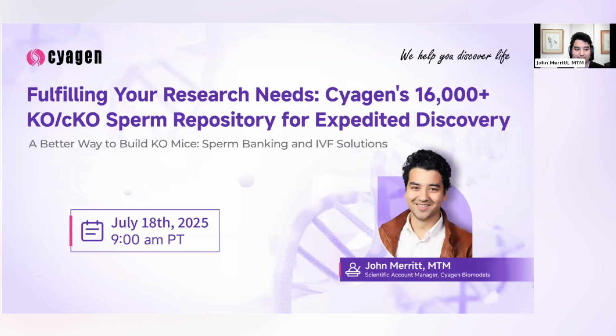I am. Yes. So the first one would be, what are the main advantages of using ICSI over standard IVF when generating mouse models, and when should I choose it? Well, both ICSI and IVF work perfectly fine. For most research needs, you want to go with IVF just simply because it's more affordable. But we do ICSI only when there's fertility issues and we want to conserve eggs essentially.